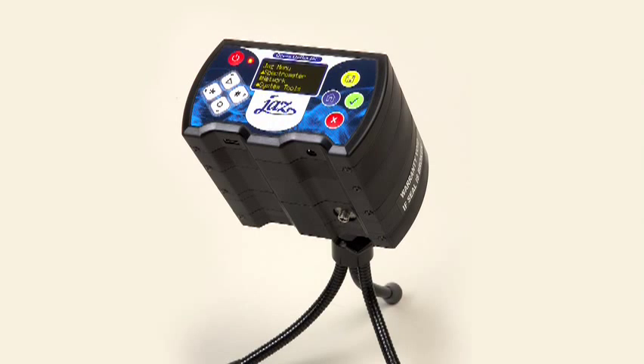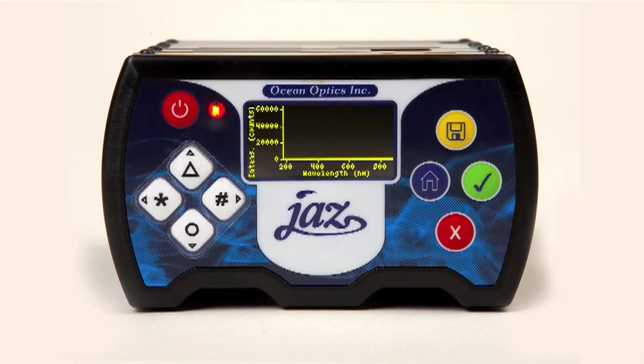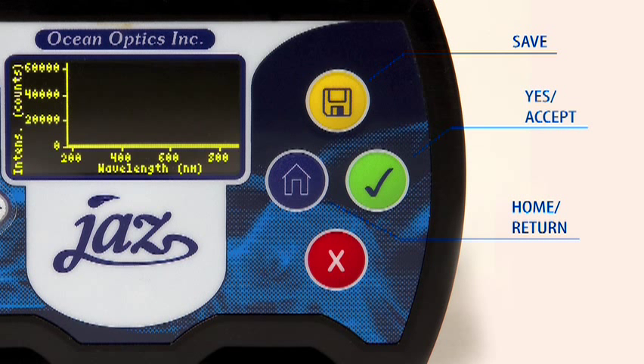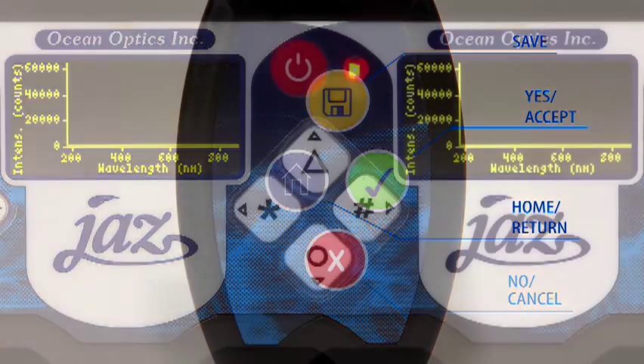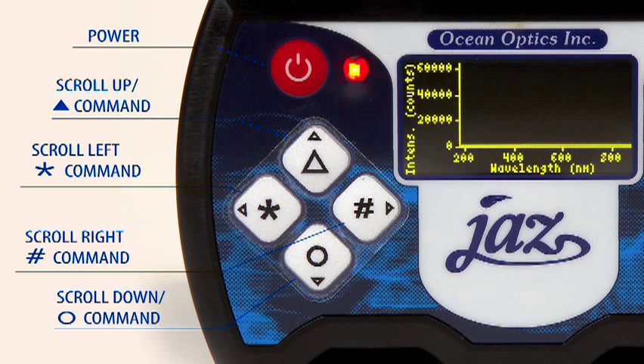The first thing you may notice about your JAZZ is its colorful display of buttons. It's important to familiarize yourself with the buttons, as they may have more than one function. There are four colored buttons next to the OLED display. The yellow button saves data to the SD card. Blue is used to return home to the main screen. The green button accepts a command, while the red X button is to cancel or return back to a previous screen. There are four additional white buttons with characters, as well as a red power button on the opposite side of the display.